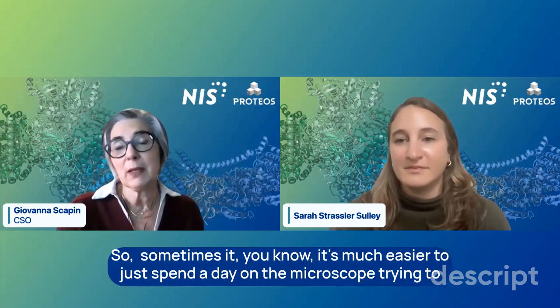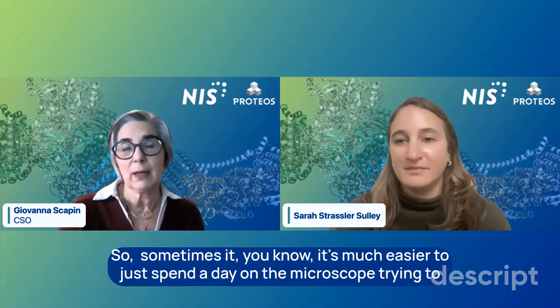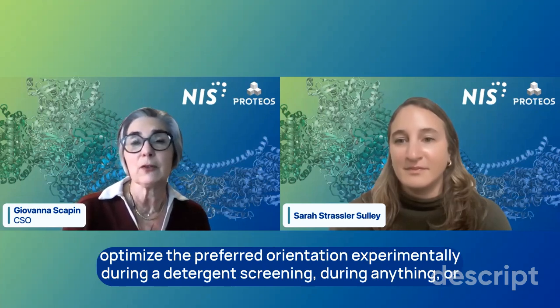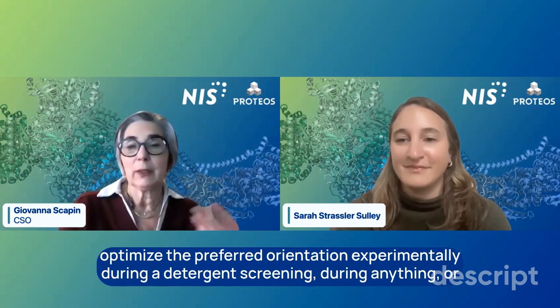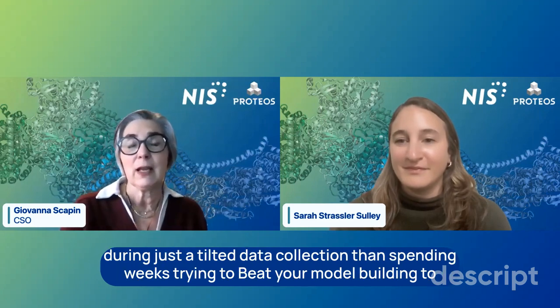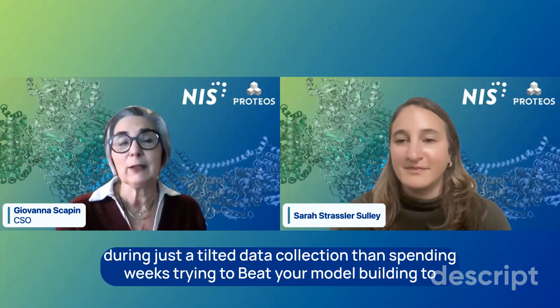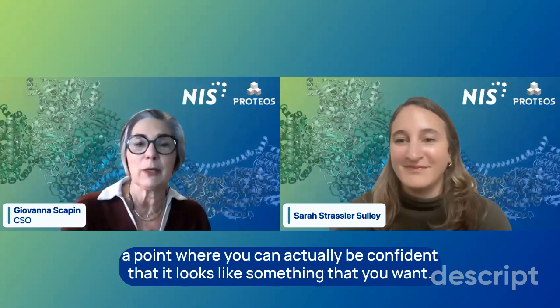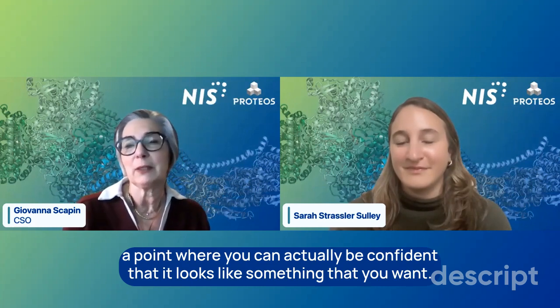So sometimes it's much easier to just spend a day on the microscope trying to optimize the preferred orientation experimentally, during a detergent screening, or during just a tilted data collection, than spending weeks trying to push your model building to a point where you can actually be confident that it looks like something that you want.